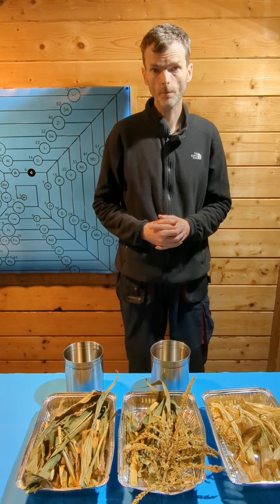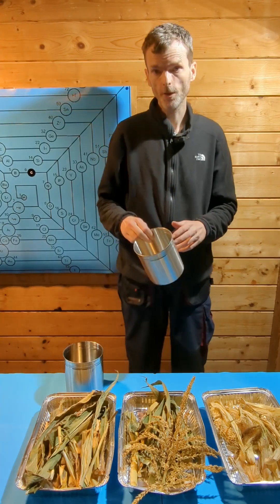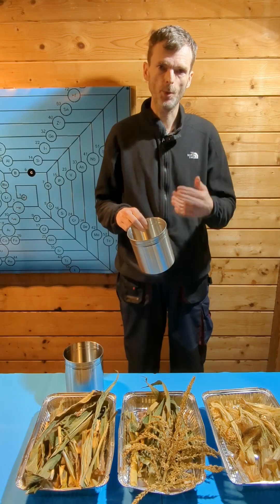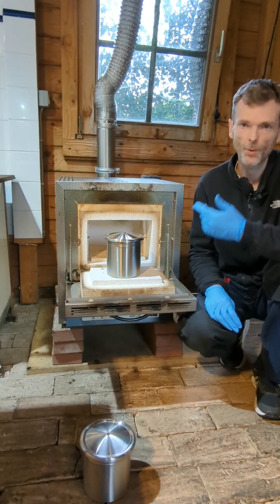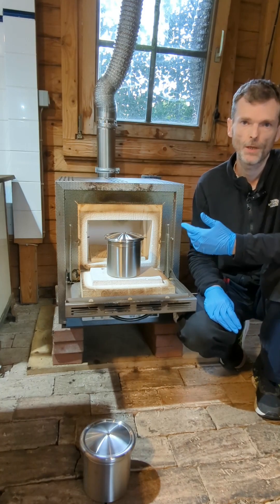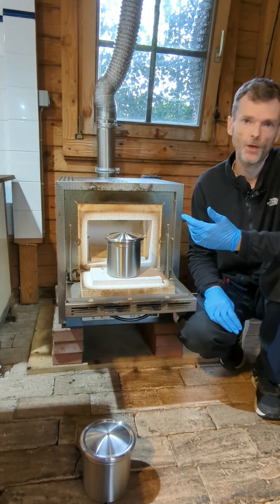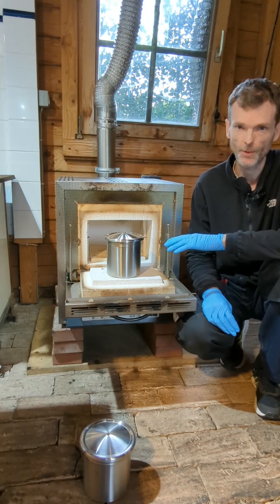The biomass is dry now. In the next step, I will fill the biomass into steel crucibles and then put the crucibles into a furnace. The process that converts biomass into biochar is called pyrolysis.